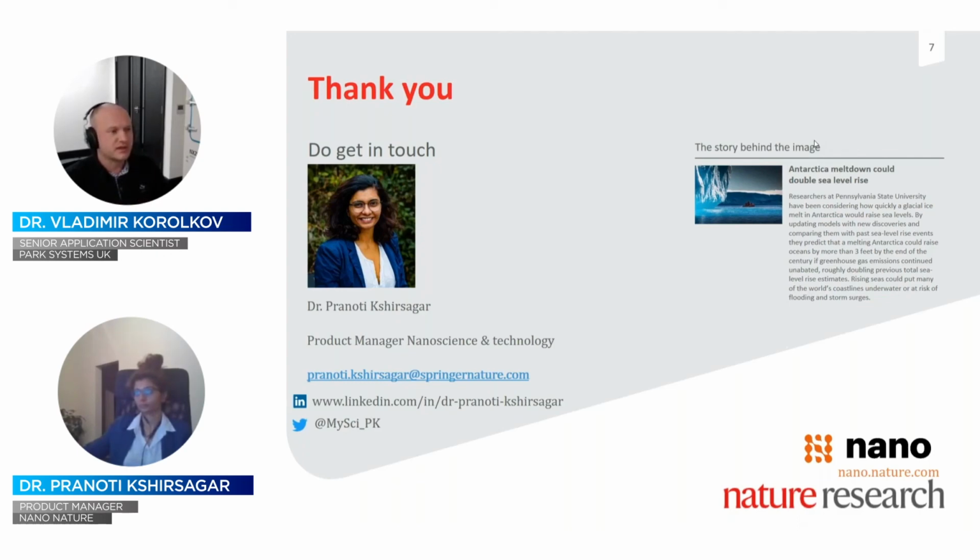That is a very common artifact. So the way you engage and the way it's implemented on the microscope is critical. The Park NX10 and similar Park platforms did a great job in terms of very exquisite control of how you can approach a sample without damaging your probe. That is quite unique technology here on the NX10 series of AFMs.